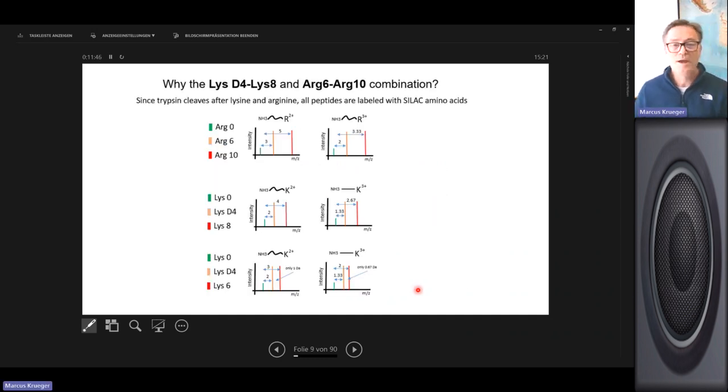And what we basically do then is, and these are the pairs which you might expect after your LCMS analysis, and these are doubly charged ions here for arginine or for lysine, and this is basically that we divide the masses by 2, right? So arginine-6 will appear as a pair with 3 Dalton mass shift, and arginine-10 will appear as a pair with 5 Dalton mass shift, right? Or 4 here. And of course, the same is true for the triple labeling. You divide your SILAC labels by 3.